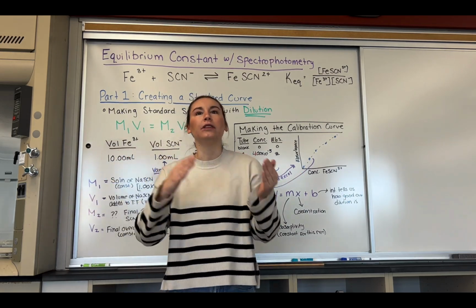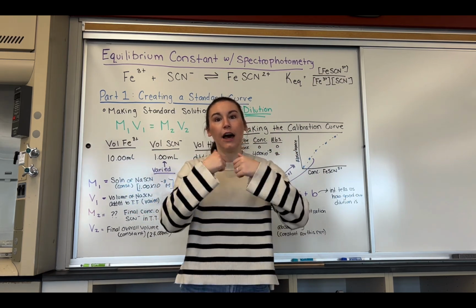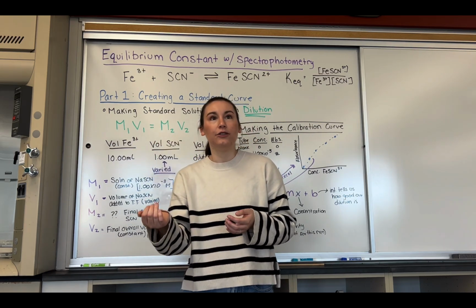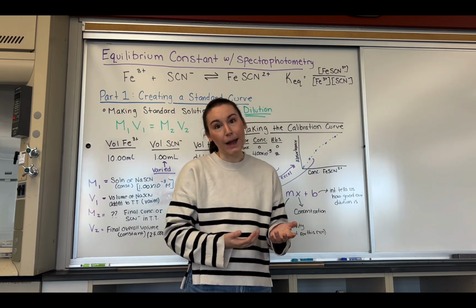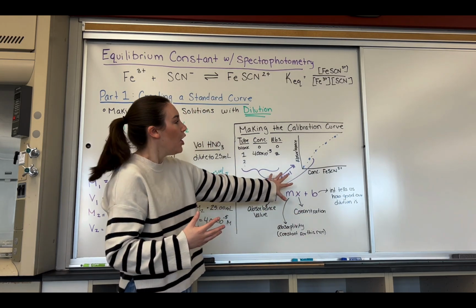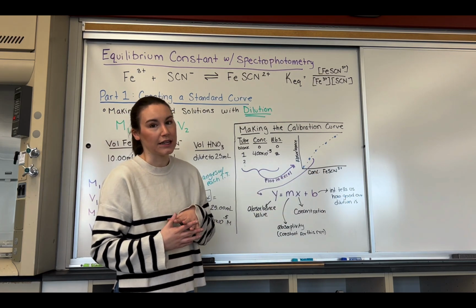This is kind of the relationship factor between the absorbance and the concentration. It's how those relate based off of this specific reaction. And this is why we can't just take a dilution, find an absorbance, or find those concentrations and use them directly, because based off of the absorbance that we find, or the difference in the color, okay, we have to relate them using this value, okay? So this is a constant, and that's what we'll use for our next portion.